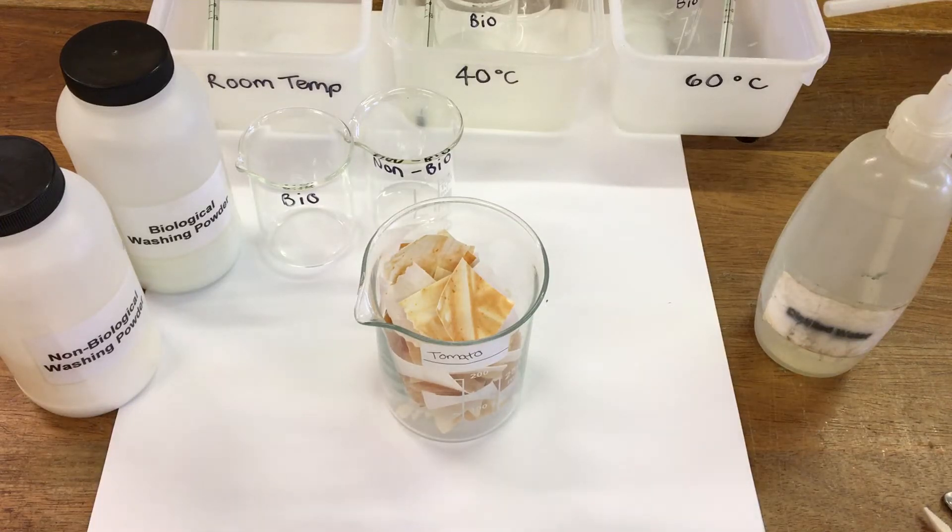Today we're going to do an experiment to look at how different kinds of washing powders work. We're going to use non-biological washing powder and biological washing powder. Biological washing powder uses biological catalysts, also called enzymes.